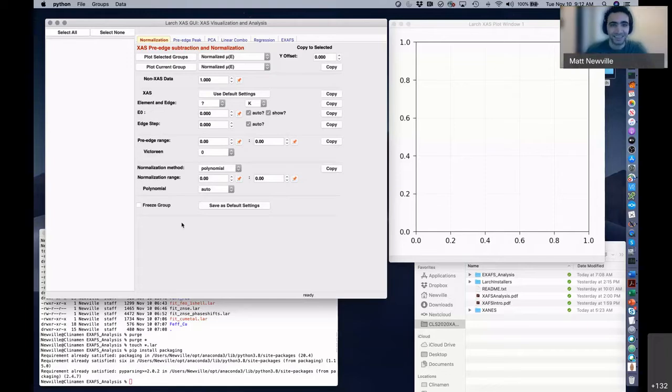Exactly. And there is one more comment, I guess. The question is, does a lower Fourier transform peak mean a lower coordination number? An example is molybdenum oxyanions, especially when distortion happens. In that Fourier transform, the amplitude of the peak has all of those factors: the scattering factor F, the coordination number, and the sigma squared.